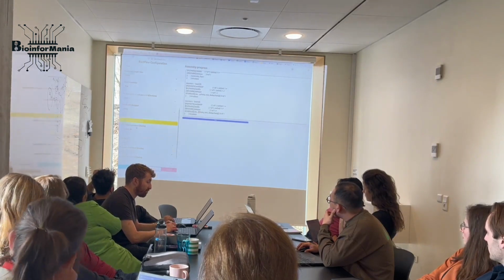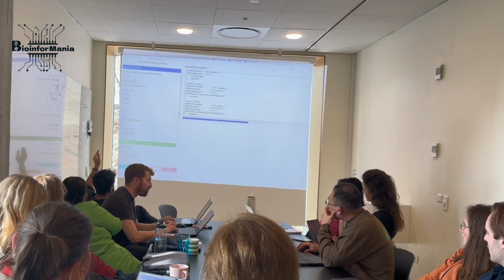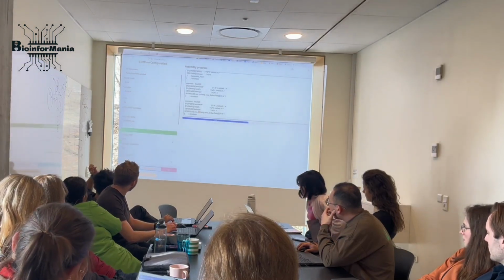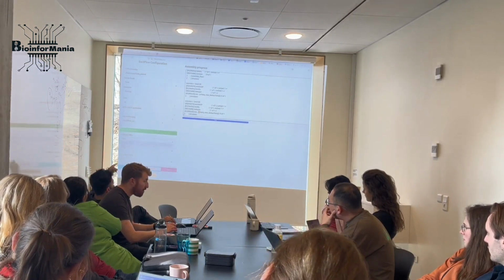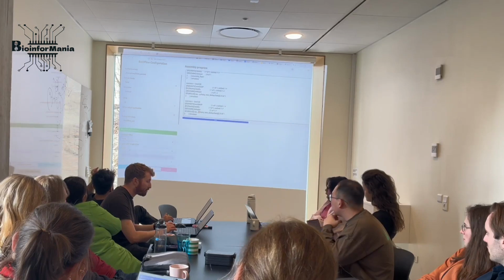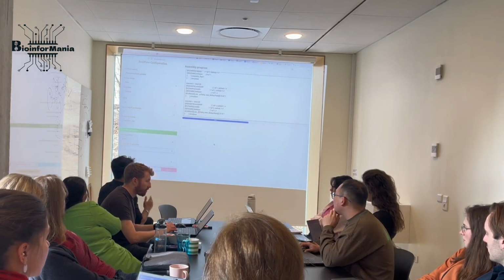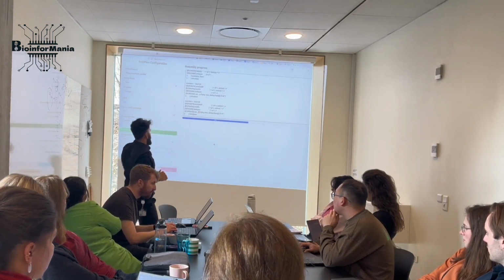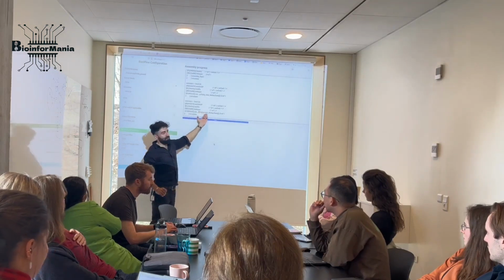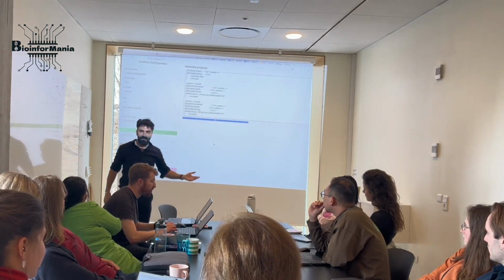So we haven't set anything else to be done here. Of course, concatenation is false, so it's not queued there. What else? Coverage filter, if it was true, it will be queued there, step by step. Quality length is false. If it was true, it will be queued there. Anything that you set here to true will be queued here. And this step takes most of the time. This is fastq assembly. It assembles all those reads, computationally very expensive.